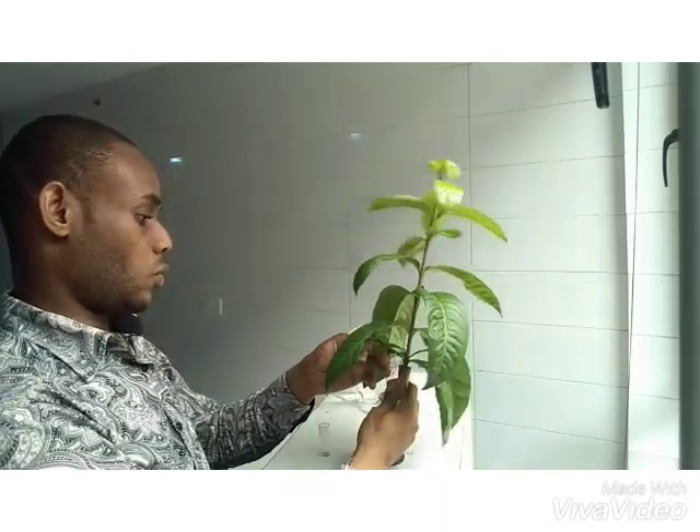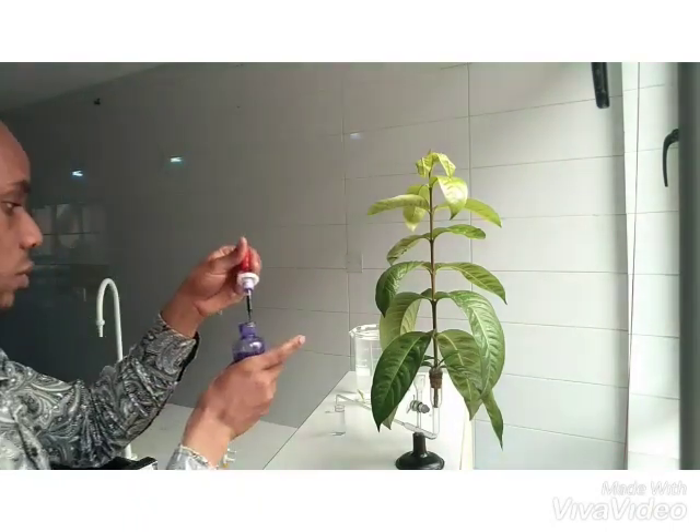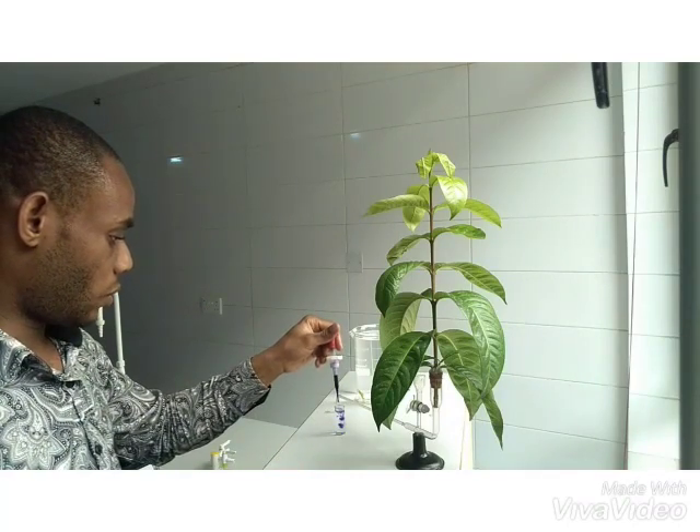So we use petroleum jelly. You gently apply the jelly around the bottom of the plant, right into the base. We then put a small amount of water in, and add two or three drops of the dye — one, two and three.